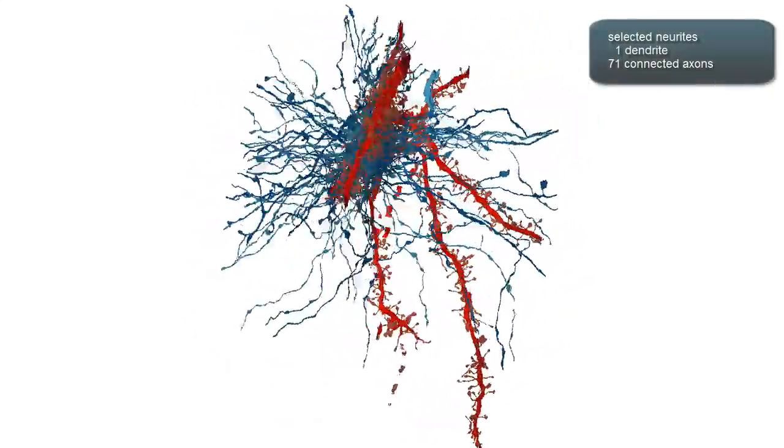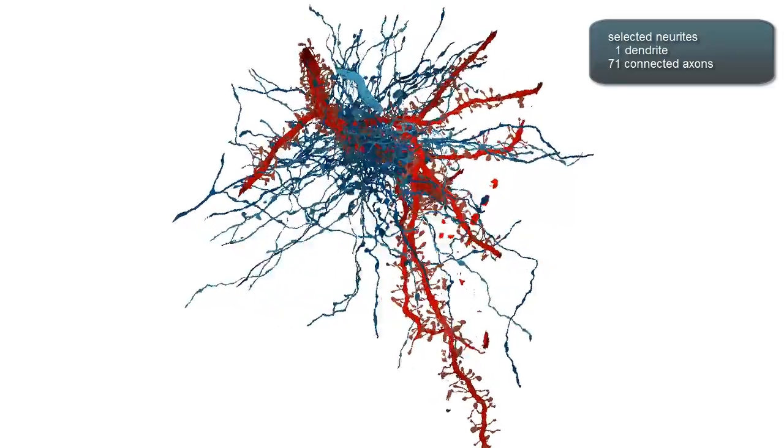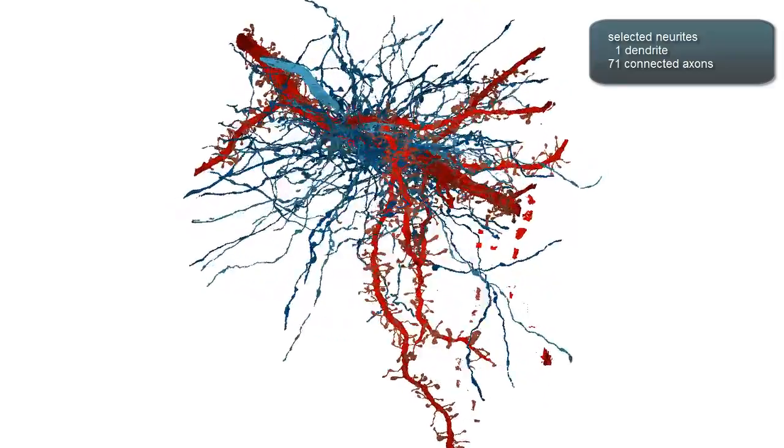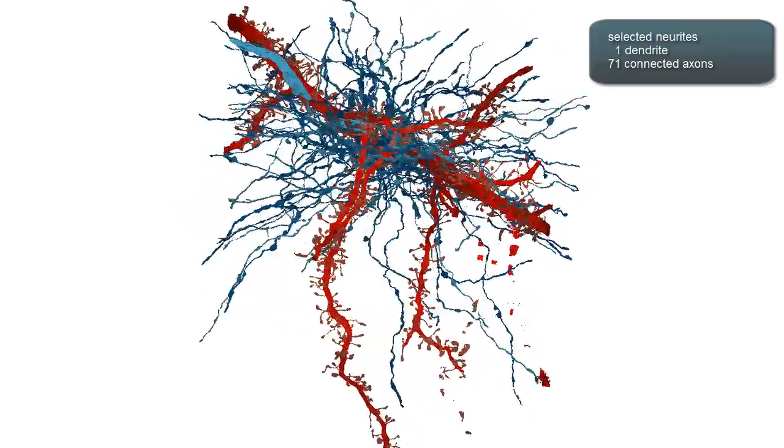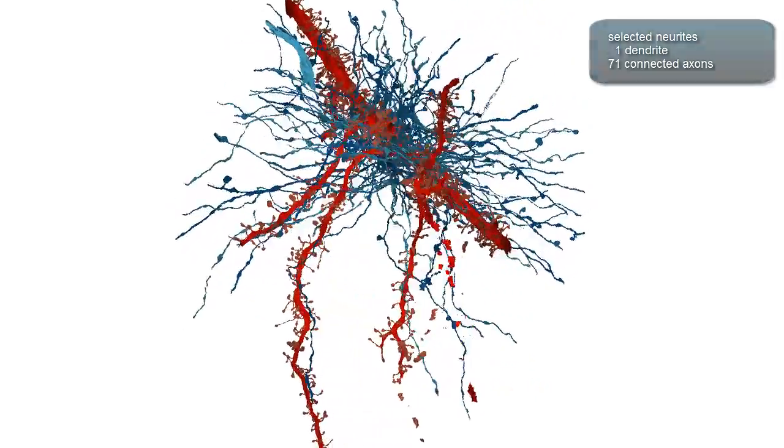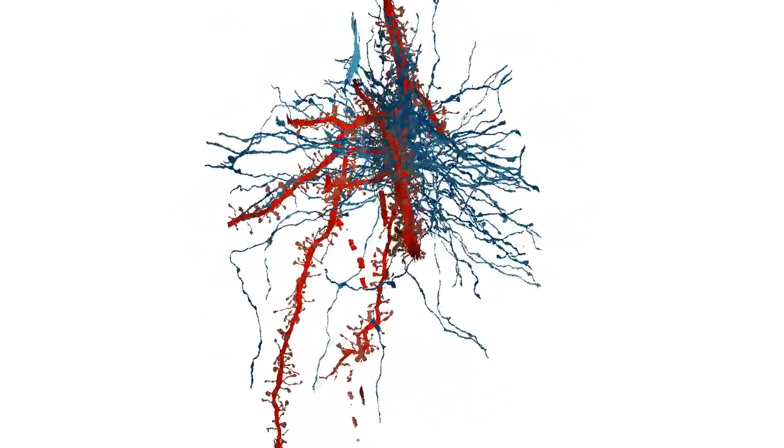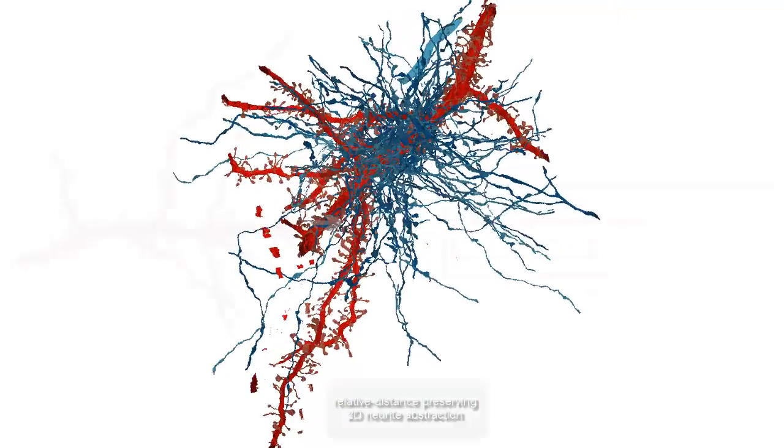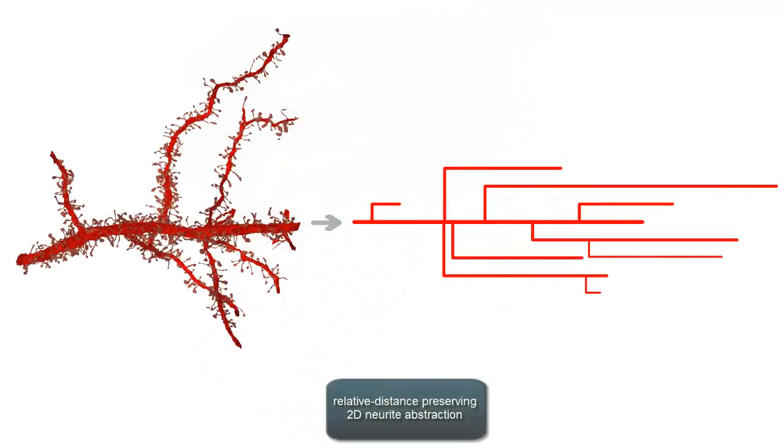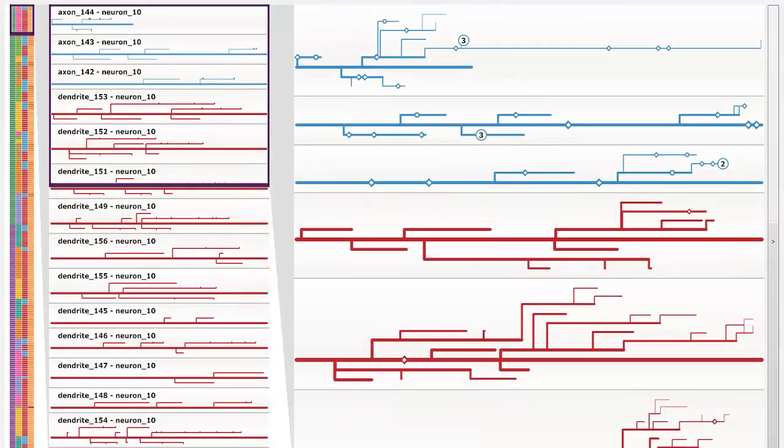However, detailed connectivity patterns are hard to see using standard 3D renderings of these volumes. We propose to abstract the complex branching and connectivity pattern of these neurites into a simplified representation inspired by 2D subway maps, as shown on the right.